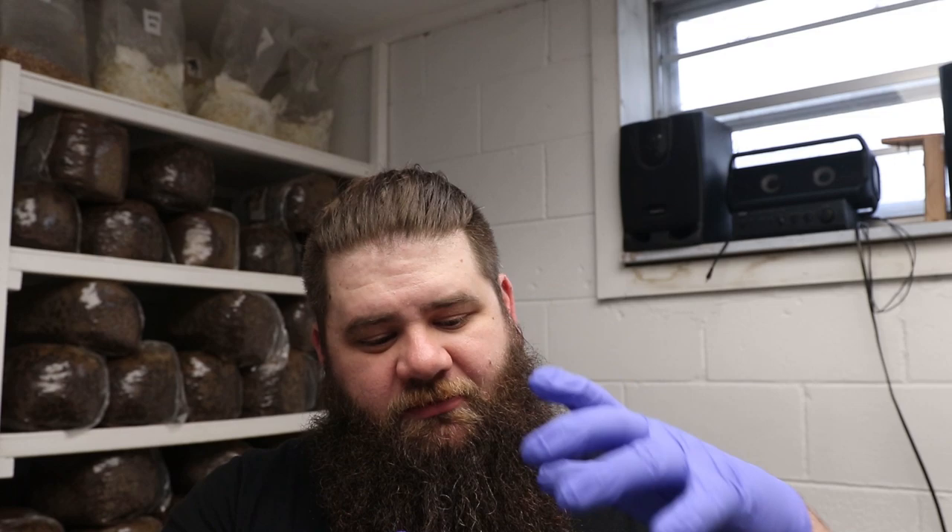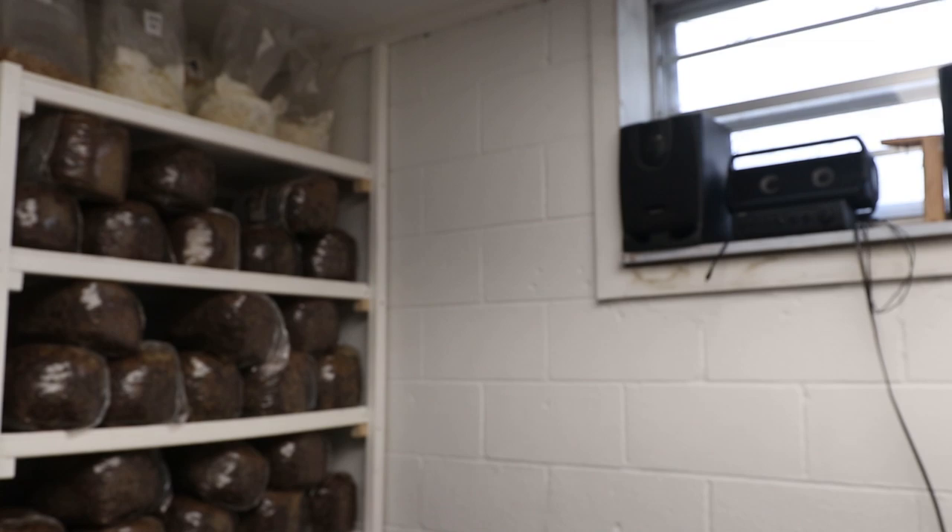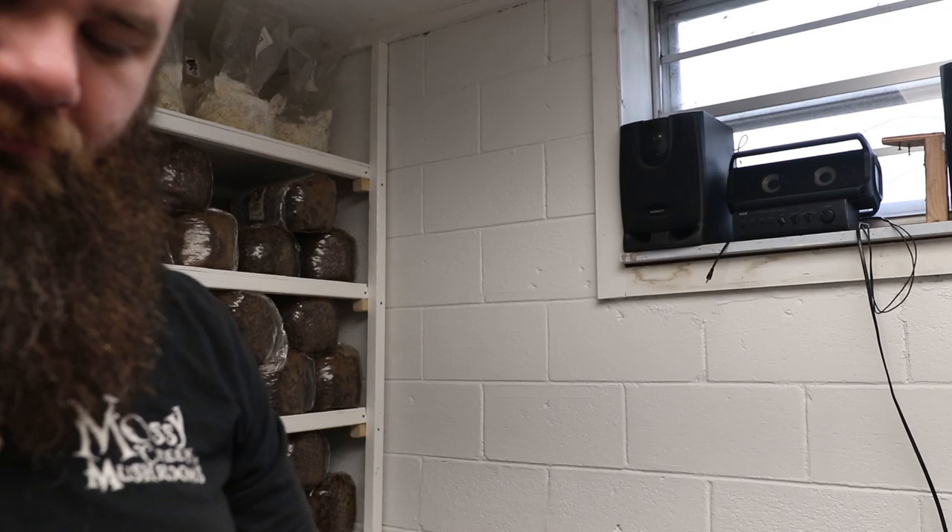I don't like petri dishes for long-term storage. You can use them for long-term storage, and I used to, but that's how I almost lost a couple of strains. The parafilm on the sides, even though they were in plastic baggies, dried out and shrank until there were holes in it, and mold was in every single culture. I actually thought I had lost my NNG oyster, but it was saved due to a technique called water agar. Water agar is just like making agar, but it's just water and agar agar - that's it.